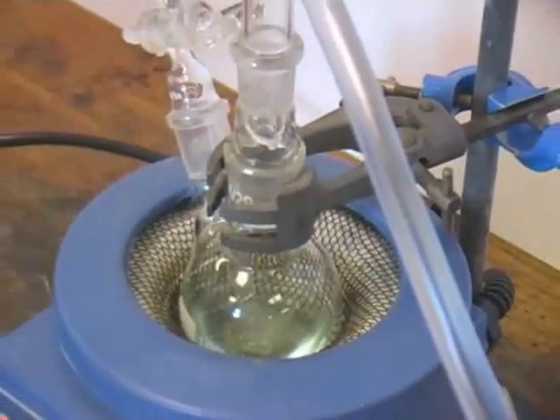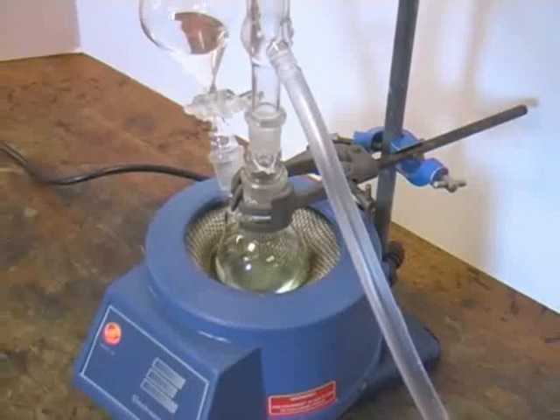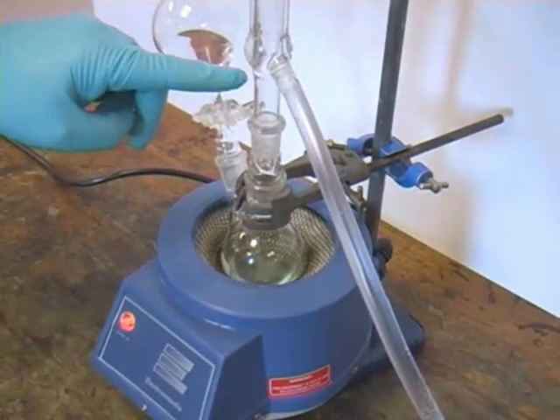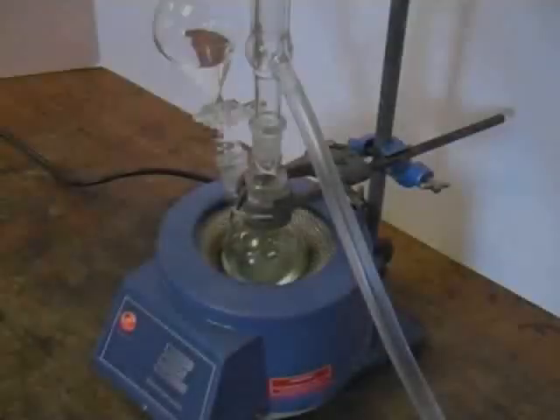Here you can see the reaction mixture in a state of reflux. As the solvent boils, its vapour condenses in the condenser before dripping back into the round bottom flask. This allows us to keep the temperature of the reaction high without losing solvent vapour.